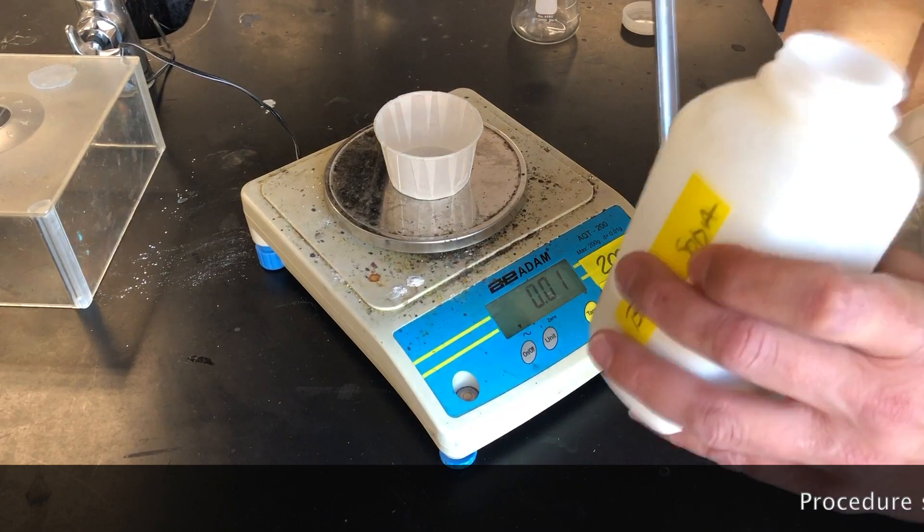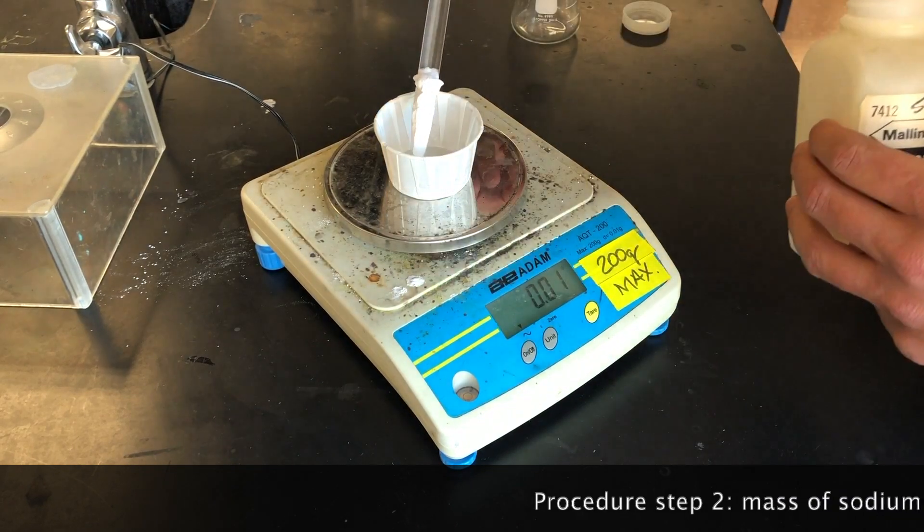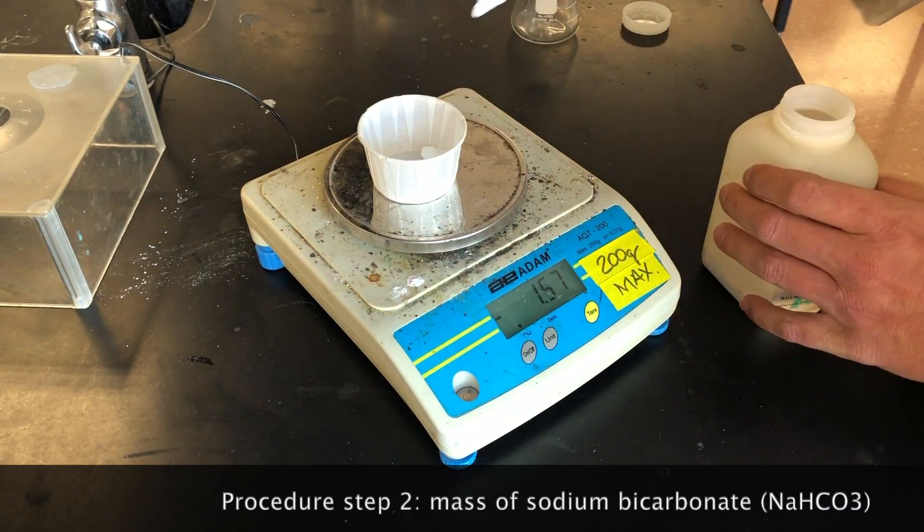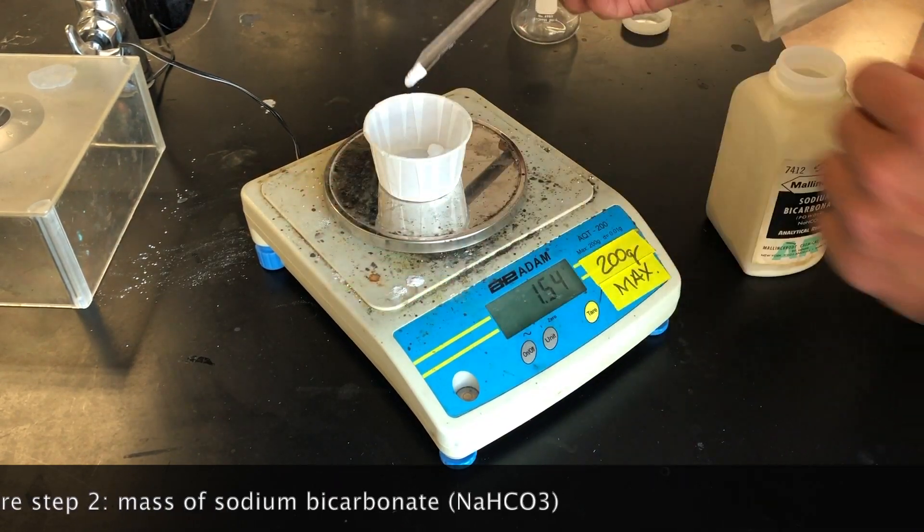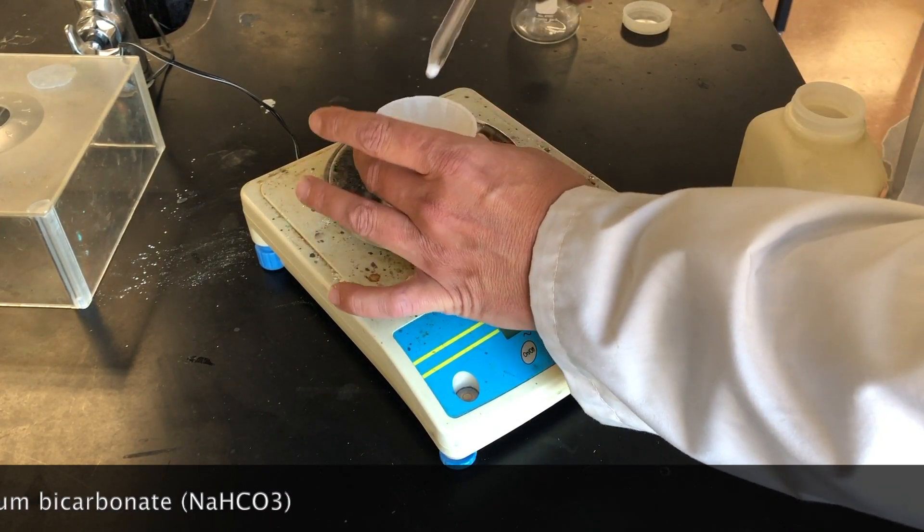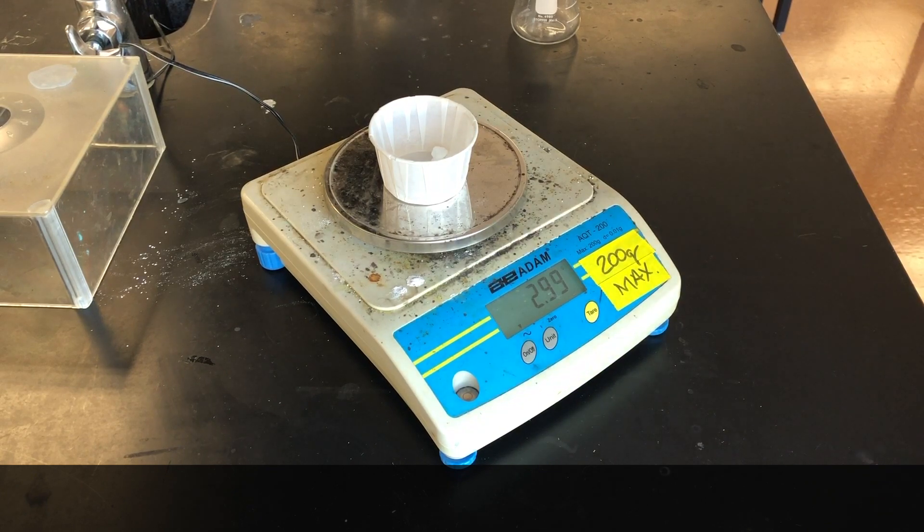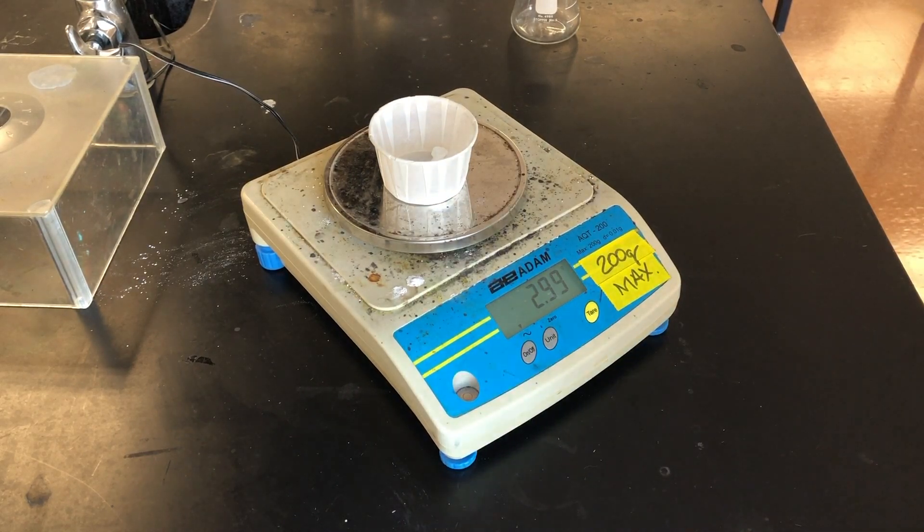Here we have to add between 2.5 and 3 grams of the sodium bicarbonate. Here we are at 2.99 grams. 2.99 grams of sodium bicarbonate, and we're going to record that amount in our data table as well. Then we're ready to proceed to the next step.